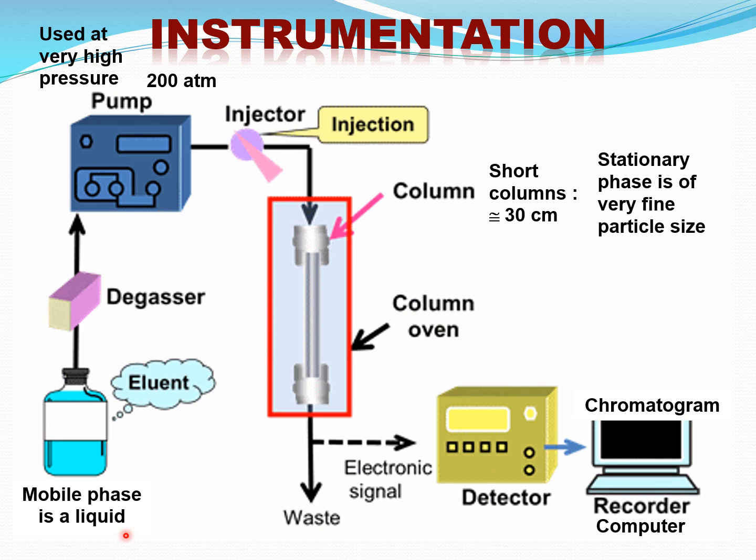So how will you work? What is a typical experiment? You take the mobile phase, pump it at high pressure into the column, and through this injector, like in GC, you are injecting the sample, the mixture of components. The mixture gets adsorbed here, and at different time intervals, each component will start coming out of this column. When it comes out, it is detected, and the result goes to the computer. Computer generates the chromatogram.